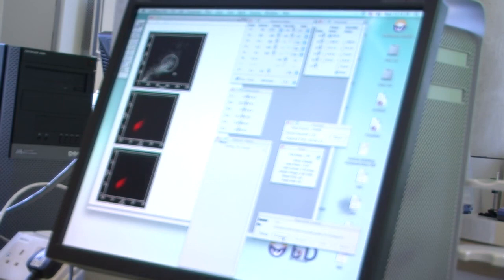If you want from those, you can even take some pictures, and after, you can include that picture as a base on your report to see the cells growing on a plate culture, and after the cells being produced.